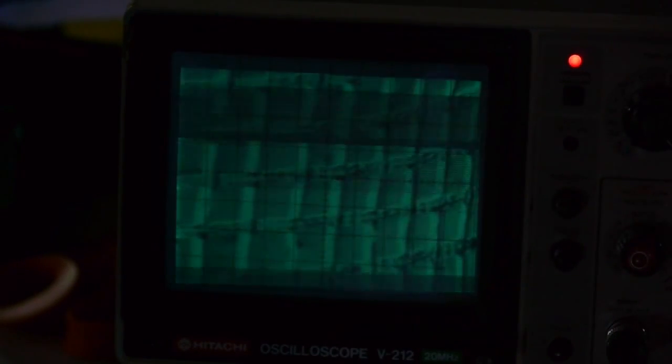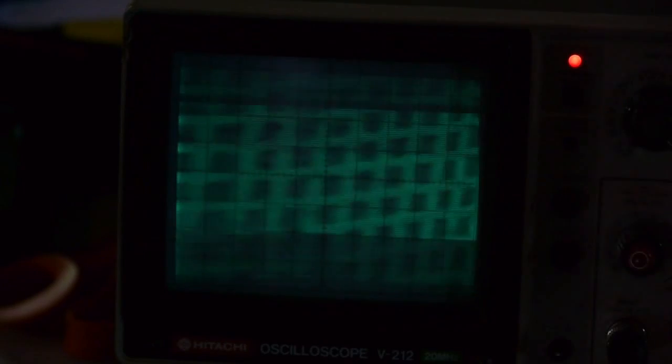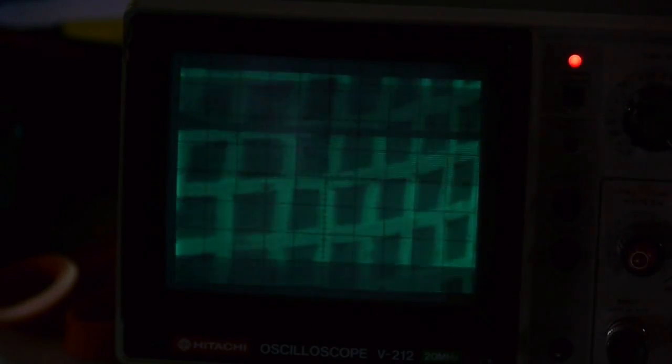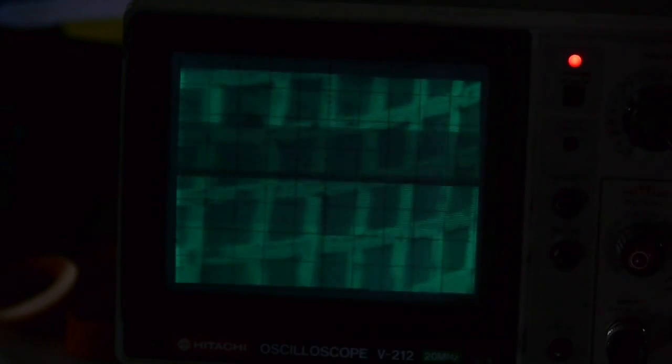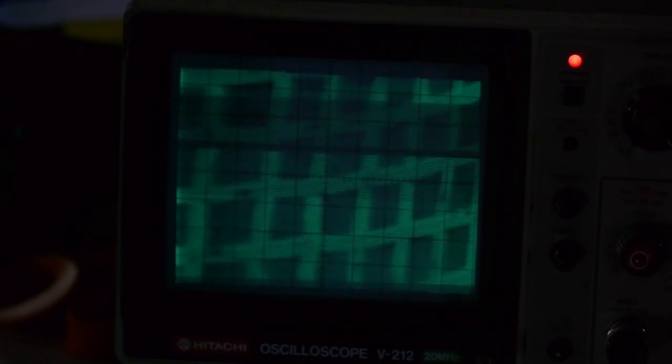So there you have it. Let's change the zoom level. The easiest way to change the zoom level is we can change the scan pattern so by doing this we sort of zoomed out and readjust the focus. To zoom in a little bit more we can make the scan pattern smaller, but what we can also do is increase the acceleration voltage and by doing that the scan pattern becomes smaller because the electrons are not as easily deflected by the plate. So I'm going to up it a couple clicks here. We are at four kilovolts now. As you can see it's kind of a big balancing act between getting all the knobs in just the right spot.